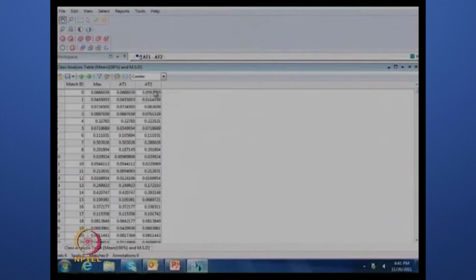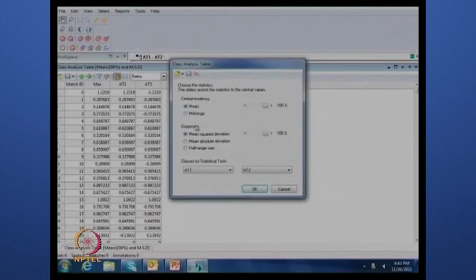Okay, so for the control and treatment, both groups we had 6 gels, right? Yes. So what are the values in each of the 6 gels for each spot? For each spot exactly. This is the averaged value again, the average of all the 3 gels from each group. This is the ratio value, which gives the upregulation or downregulation.